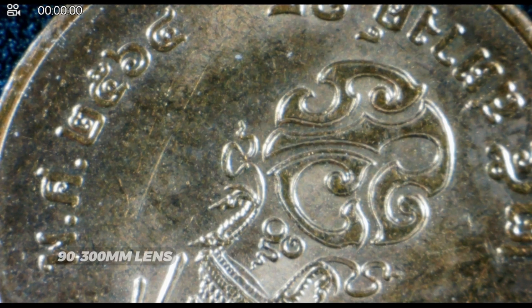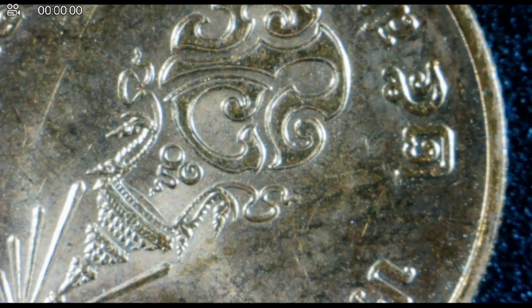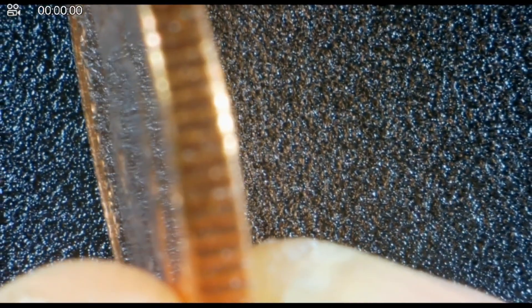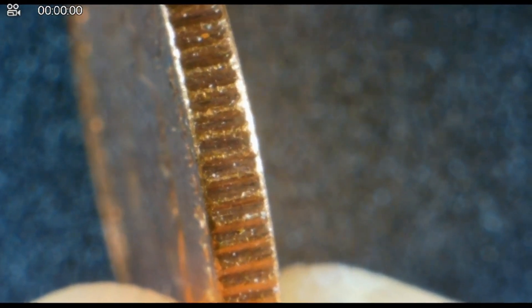Right now I'm using the 90 millimeter to 300 millimeter lens, and here we're taking a look at this coin. You can see some pretty fine detail on it. I'm going to flip it up on its side and change the focus here — these are the side divots of the coin. And here is the other side of the coin.